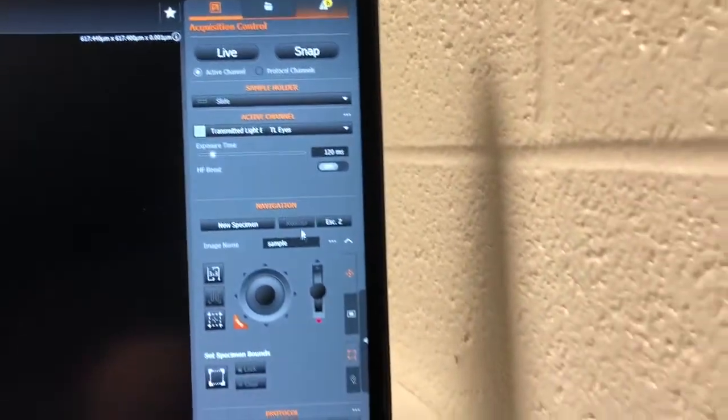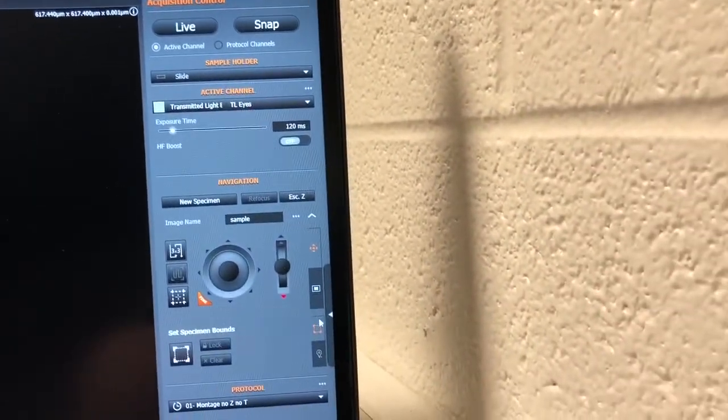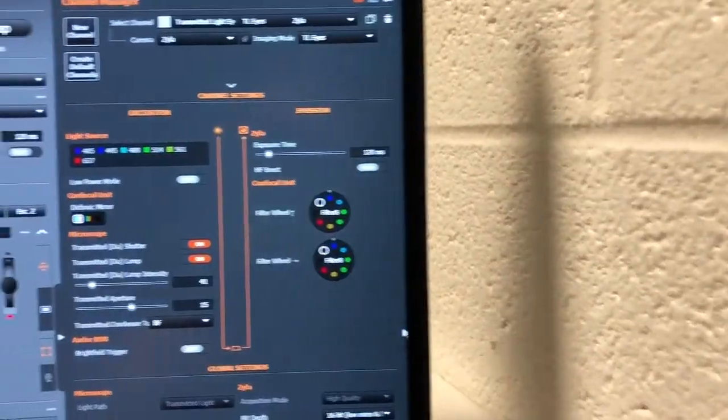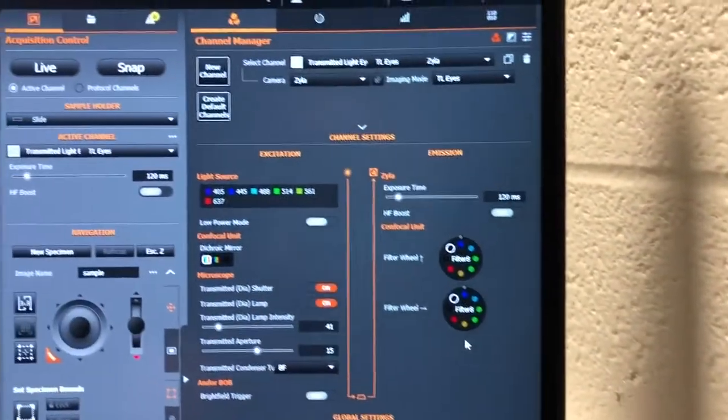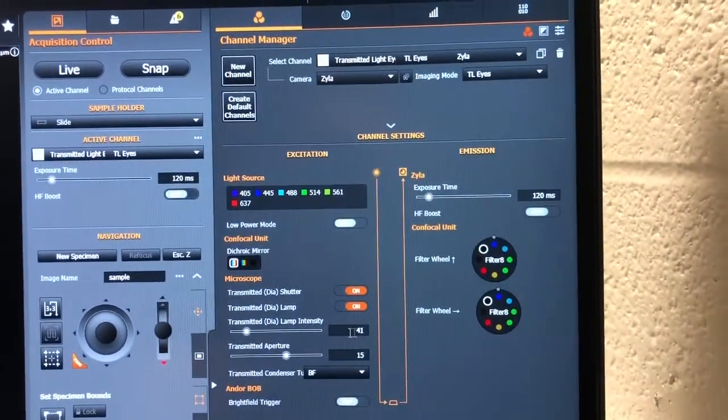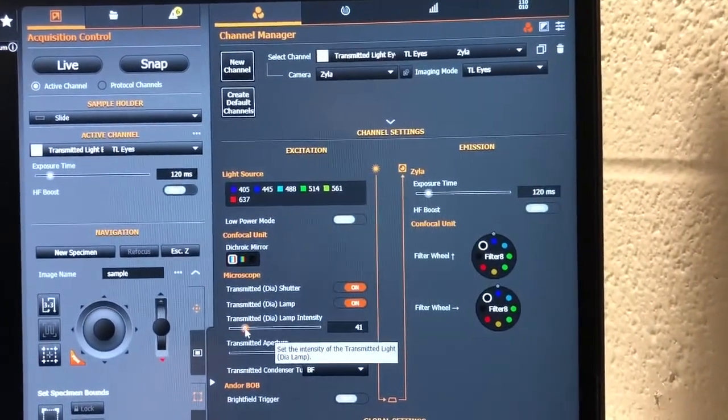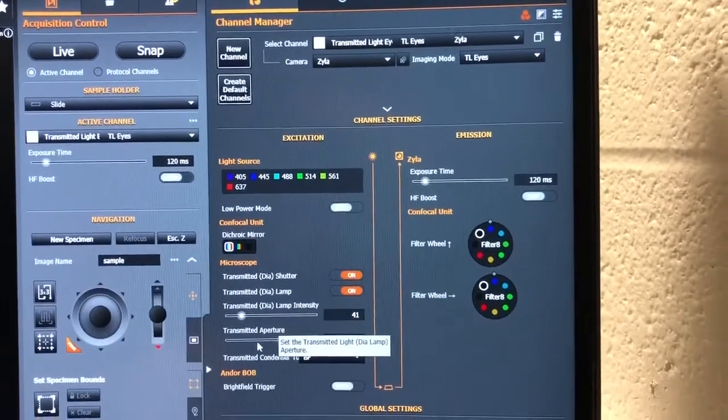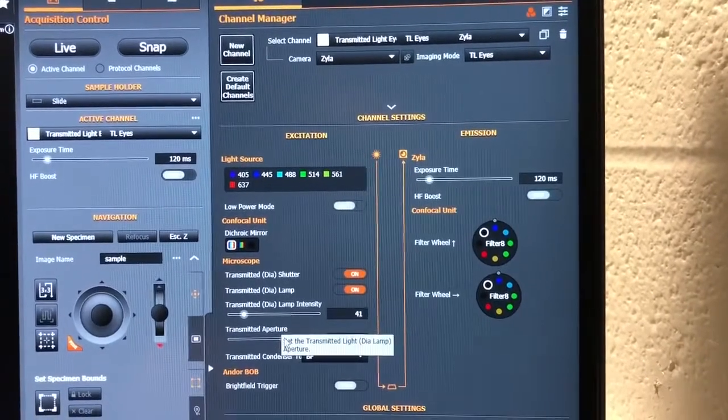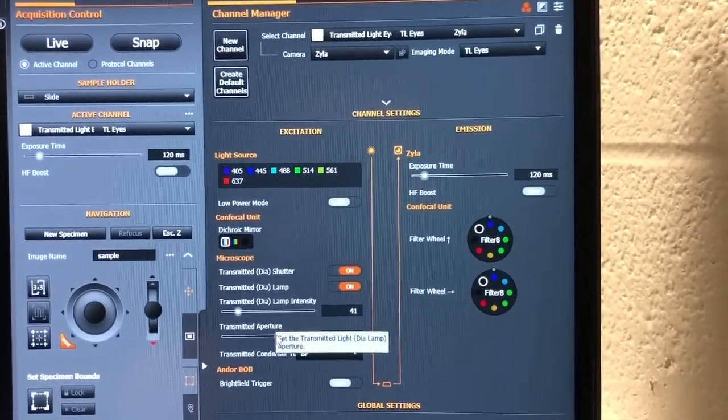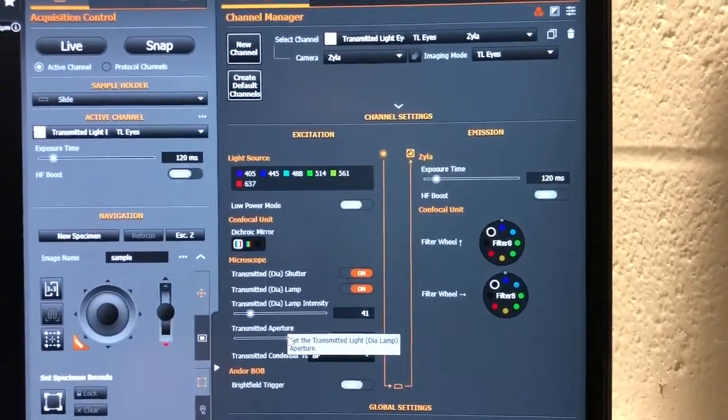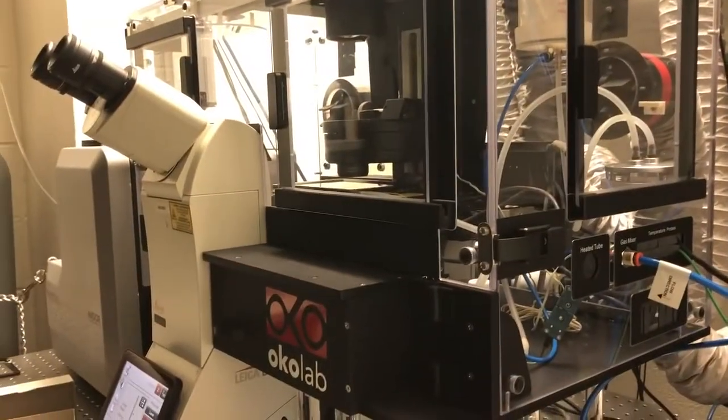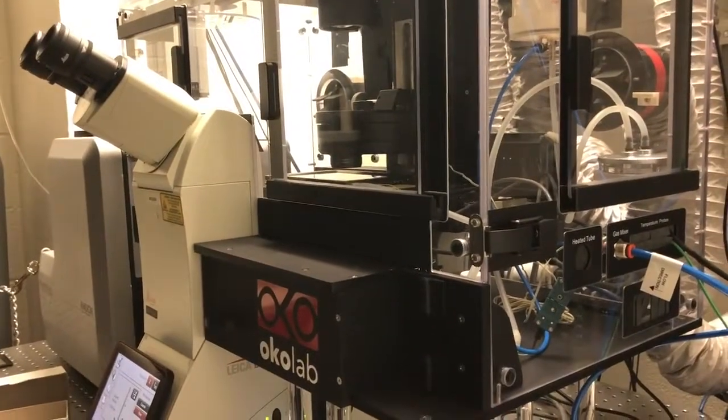We can then click on this button to expand what we see on the screen. We will be able to control the transmitted light's intensity here and the condenser aperture in this bottom slider. At that point, we have everything we need and we can go to the microscope to find our sample by eye.